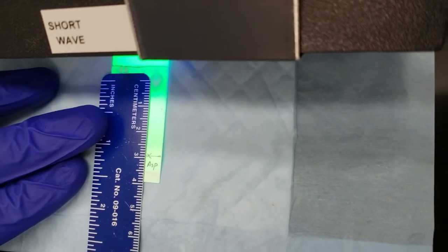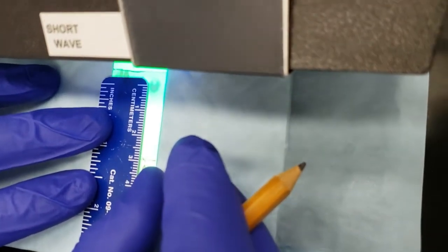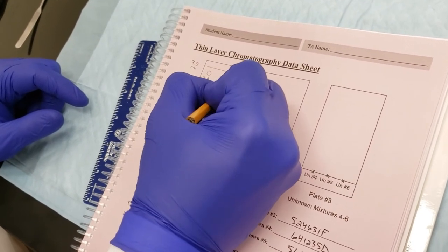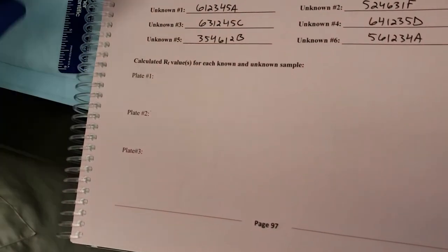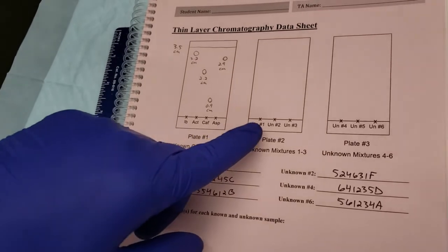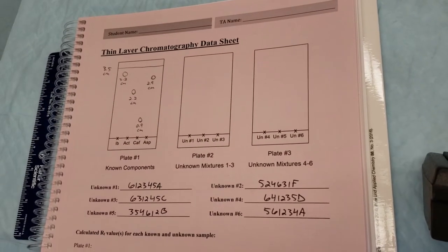Our aspirin from the center of this spot is going to be right at 2.9 centimeters. Just below our ibuprofen, 2.9 centimeters. And there's our first plate complete. Remember that you're going to have to be calculating the RF values using both the solvent front measurement and the individual measurements that we made for each of our known components. Now we're going to go back and spot all of our unknowns, all six, and compare those RF values to our starting known components.